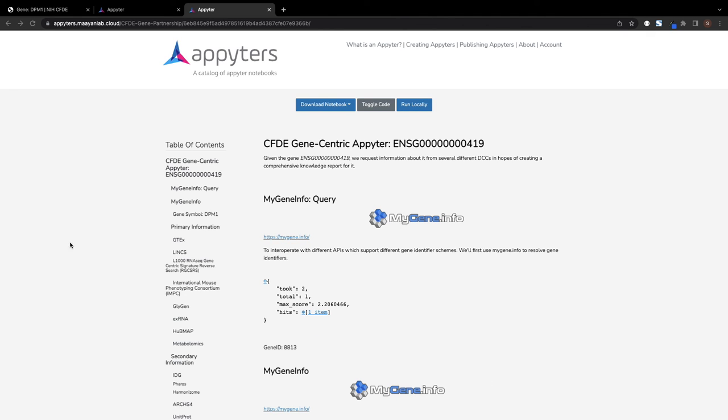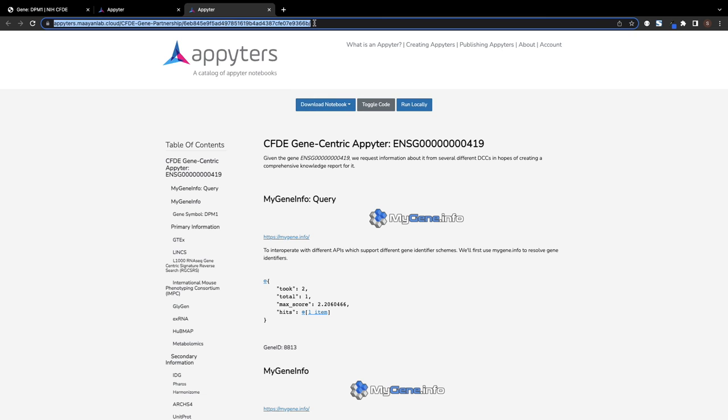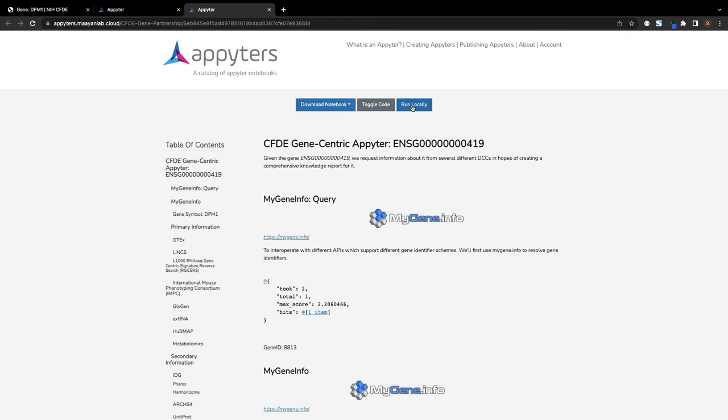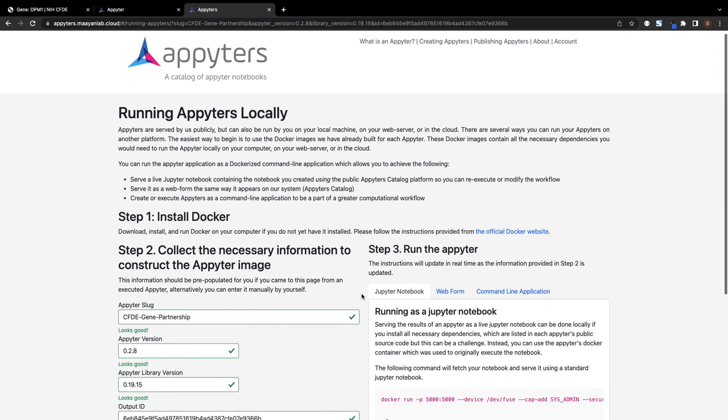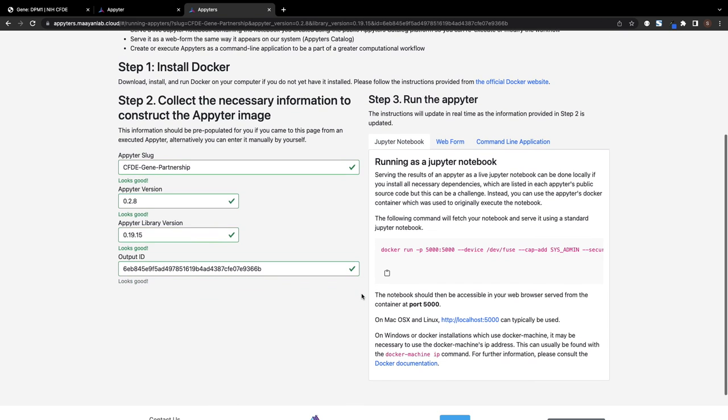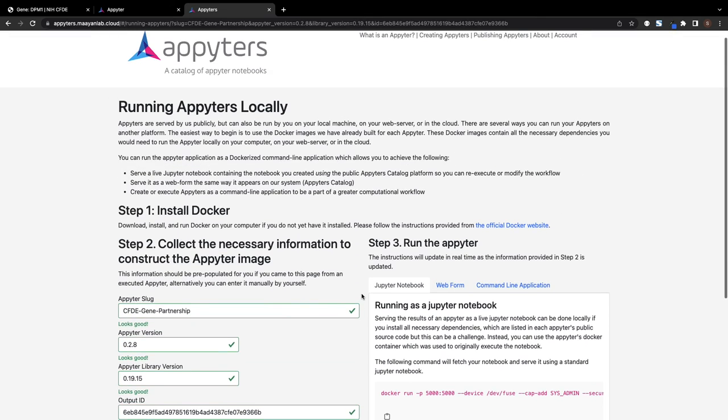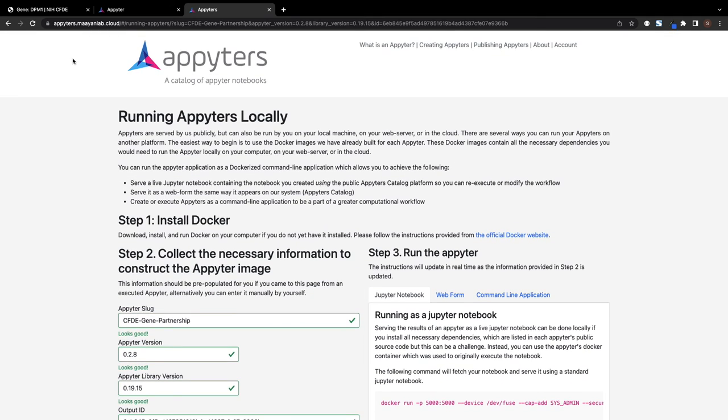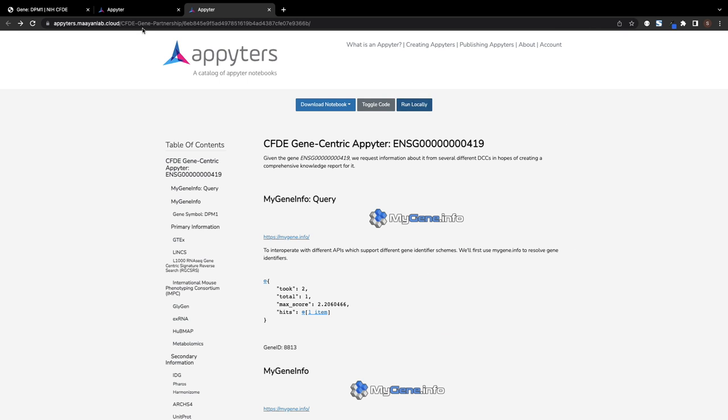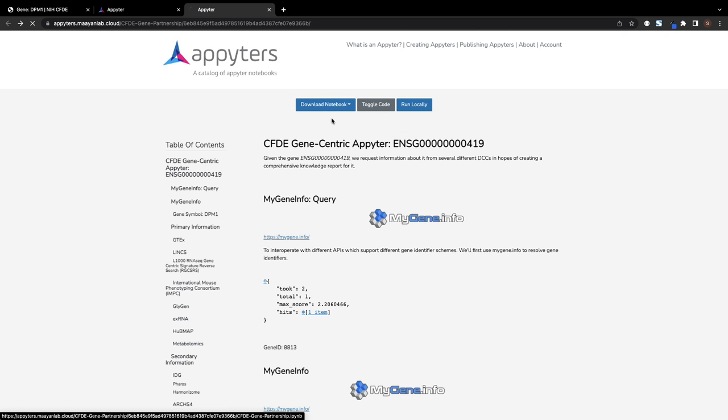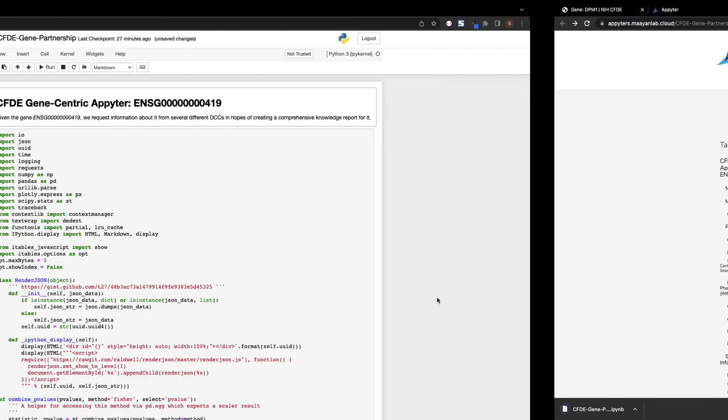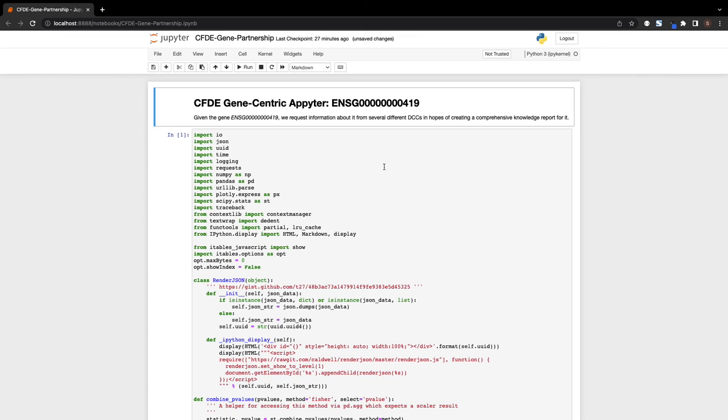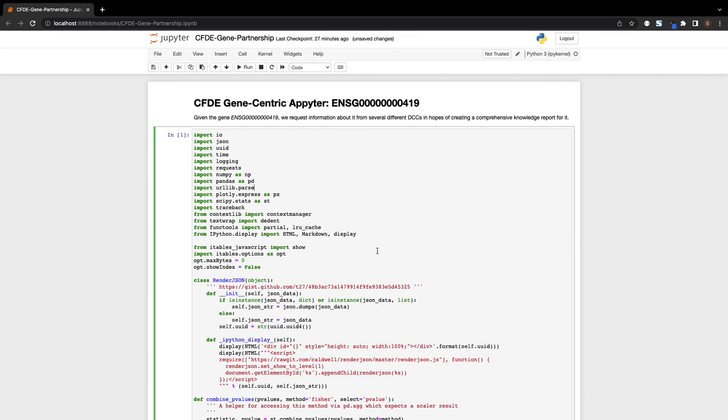The entire Appyter, including all outputs, can be shared via a unique URL. The Appyter can also run locally using a Docker container or be downloaded as a standalone Jupyter notebook to be shared, re-executed, or modified. Users can thus customize the notebook to add or remove any gene-centric sources.